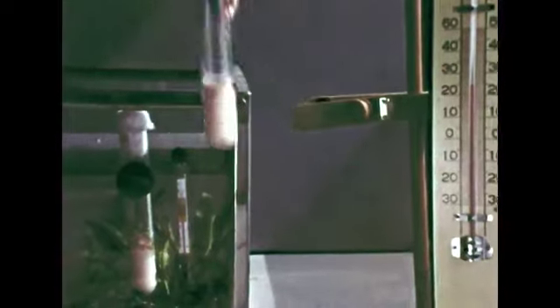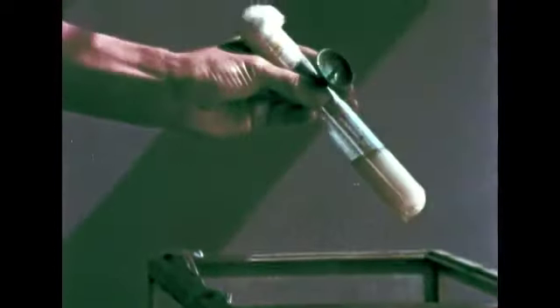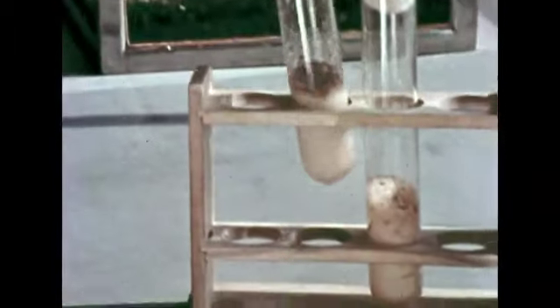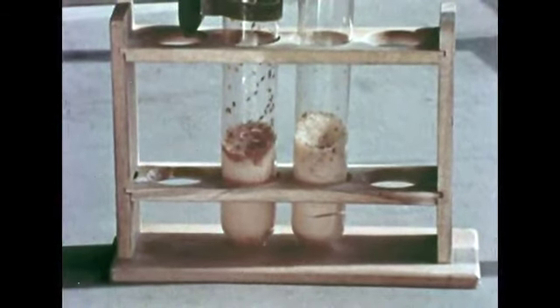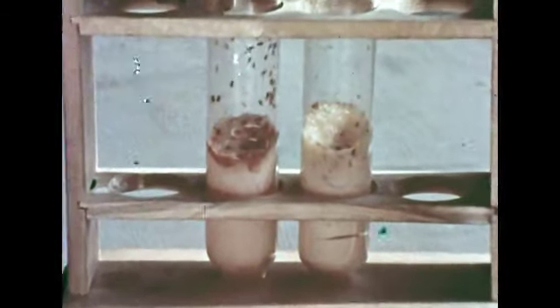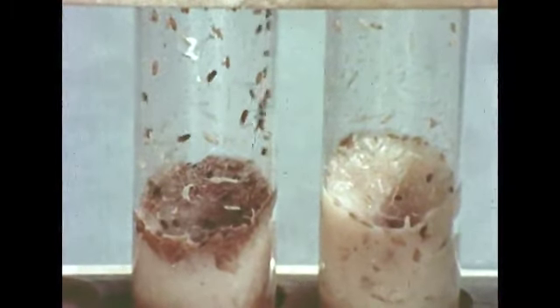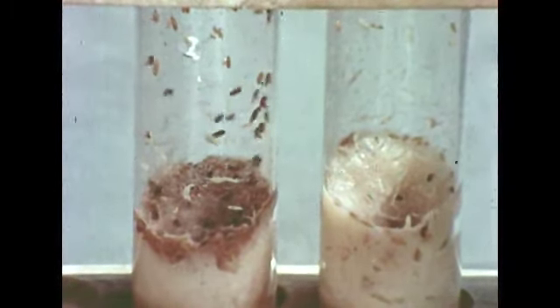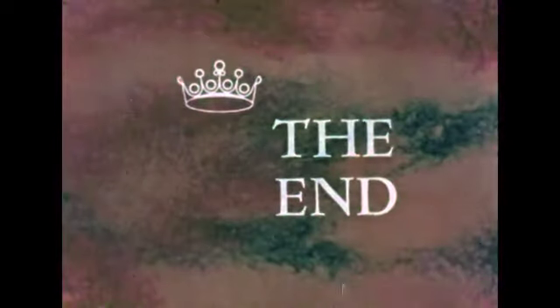At the end of the 2 weeks, we compare the tube from the air with the one from the water. Are there differences in the rate of reproduction? Can you account for the results in terms of what we saw about the fruit fly and its relationship to its environment? What do such relationships suggest for other organisms and their environments?